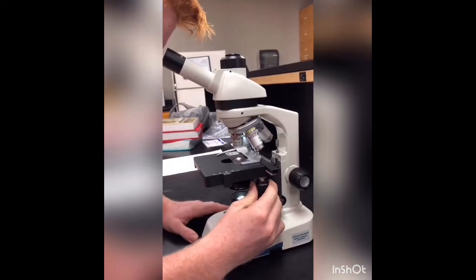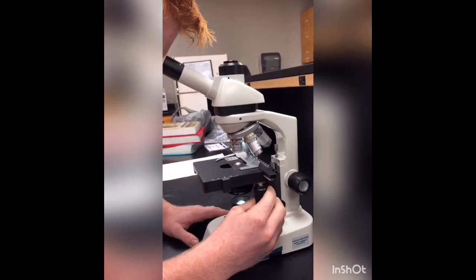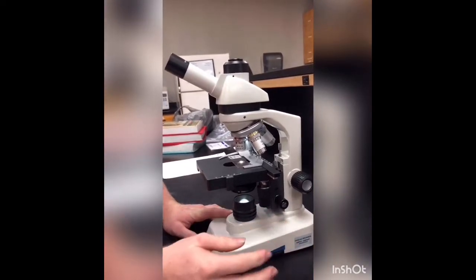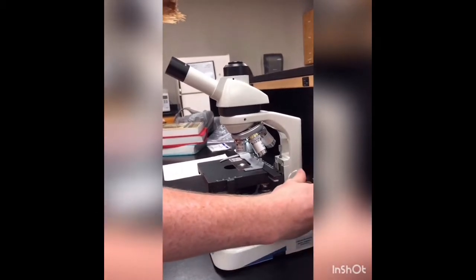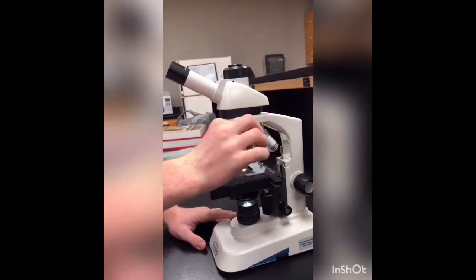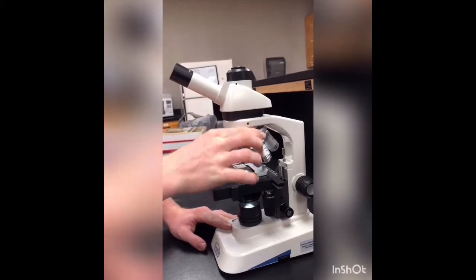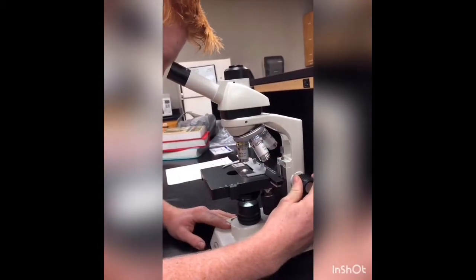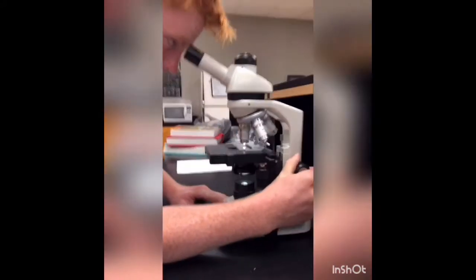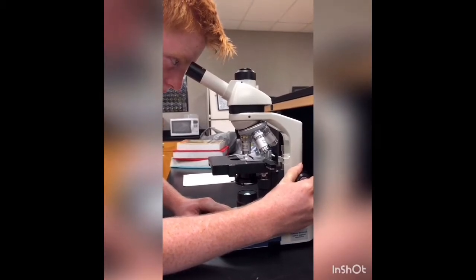And once you've found something, you can move it around to see different parts of what you're looking at. Once you're done with that, if you want to go to a higher magnification, you do not have to reset everything. You just want to bring the stage down and then rotate it to the left once, very carefully, to where it kind of clicks into place. And then you can view it again and bring your stage back up and find your specimen again and bring it into focus and view it at a greater magnification.